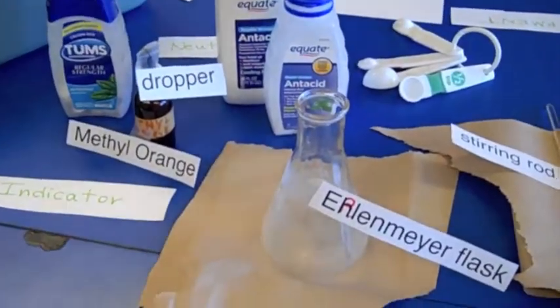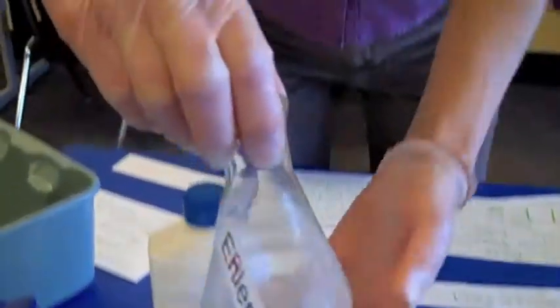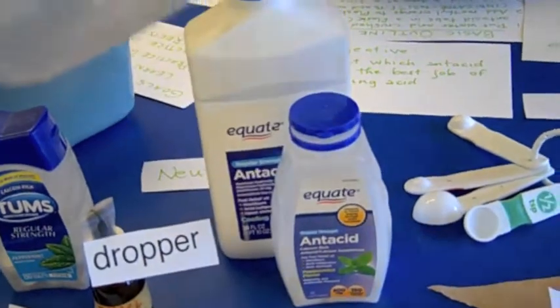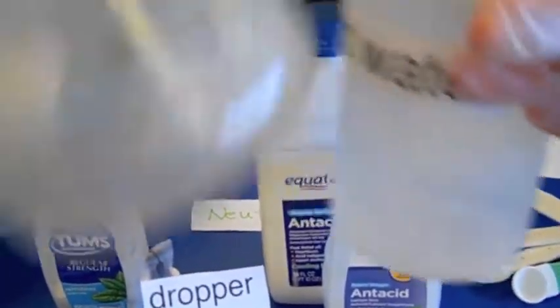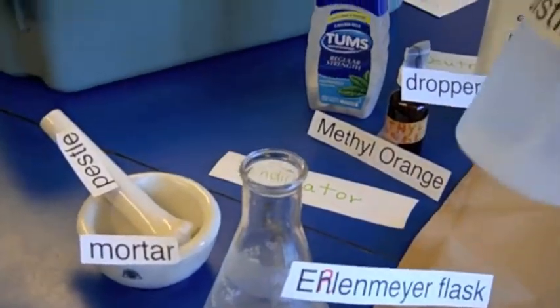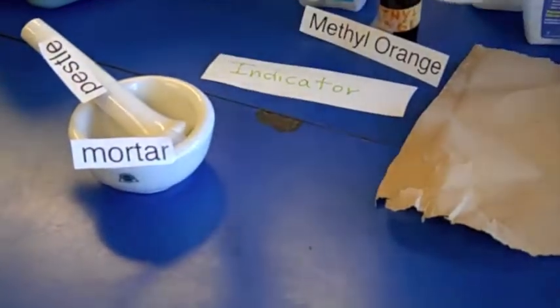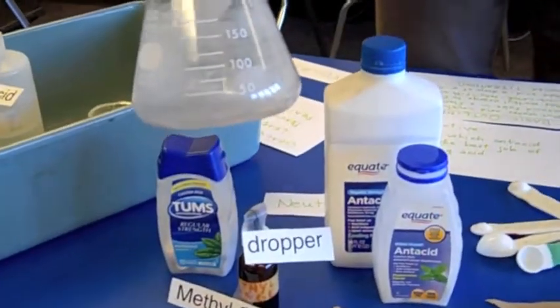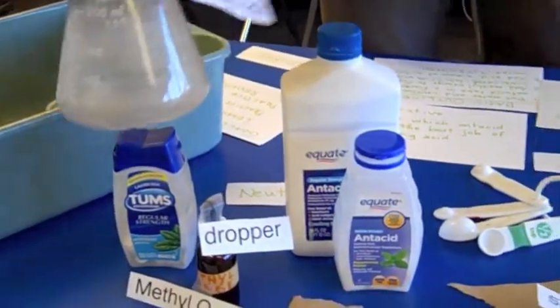And what level should the water be at in that Erlenmeyer flask? It should be at 50. There's the 50 at the bottom. If 3 rinses did not fill it to 50, you want to put it on a flat surface and carefully add more distilled water until it reaches 50. If you go over or under a little bit, it's not that big a deal. You want to be as close to 50 as possible, though.